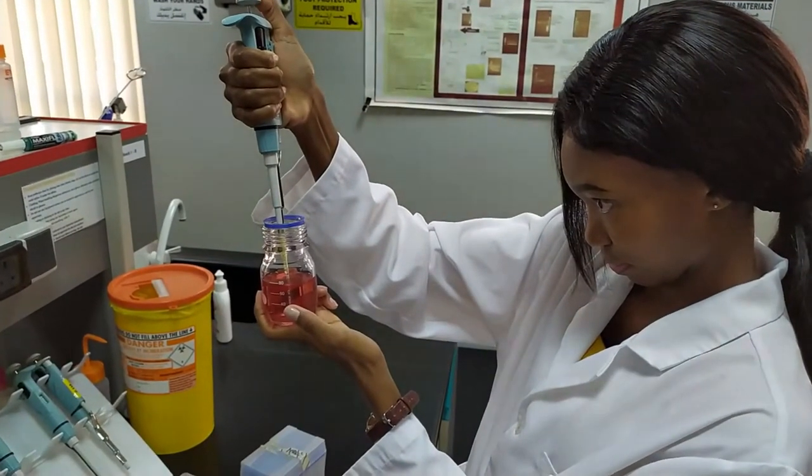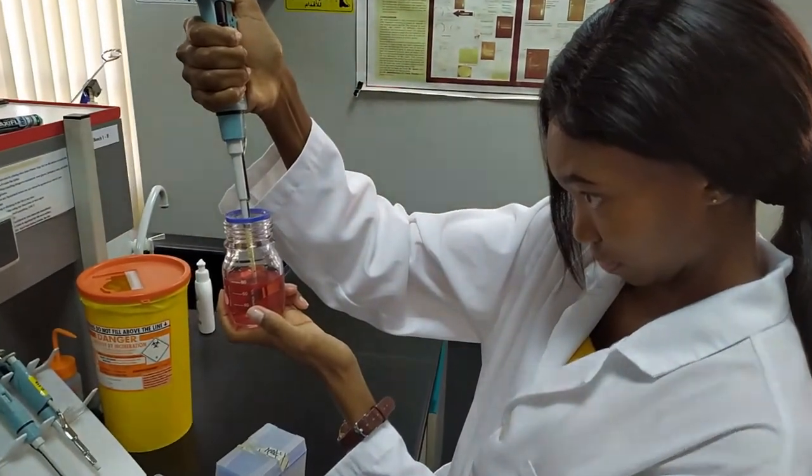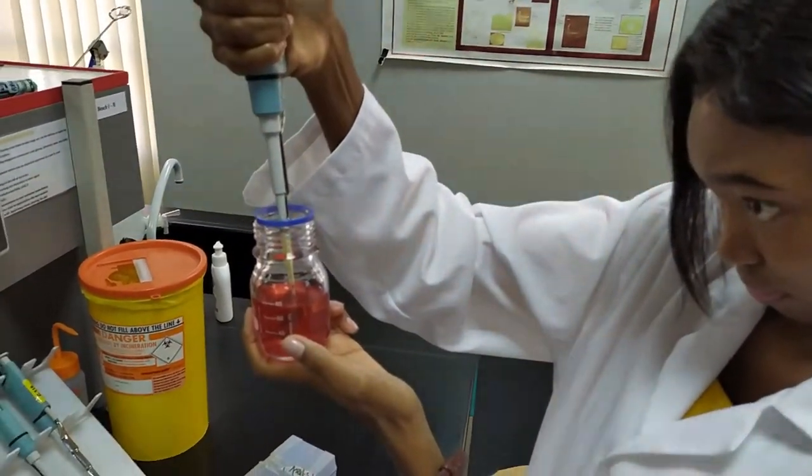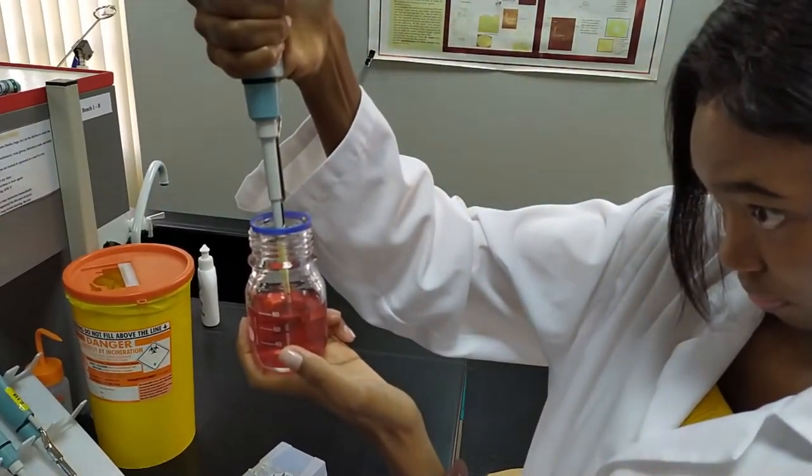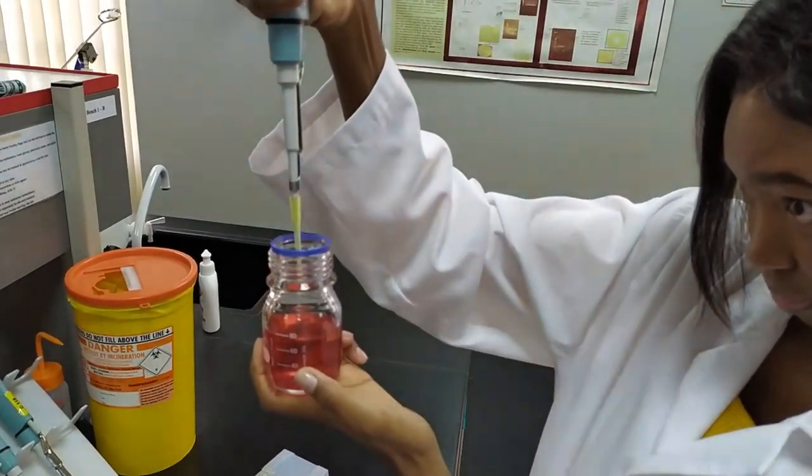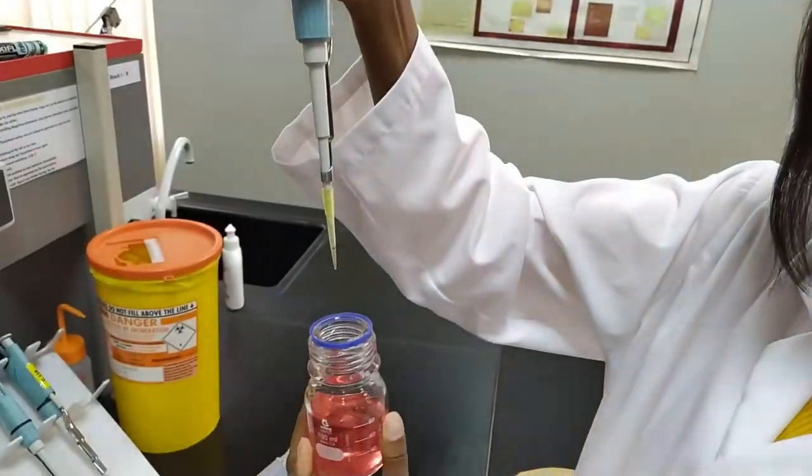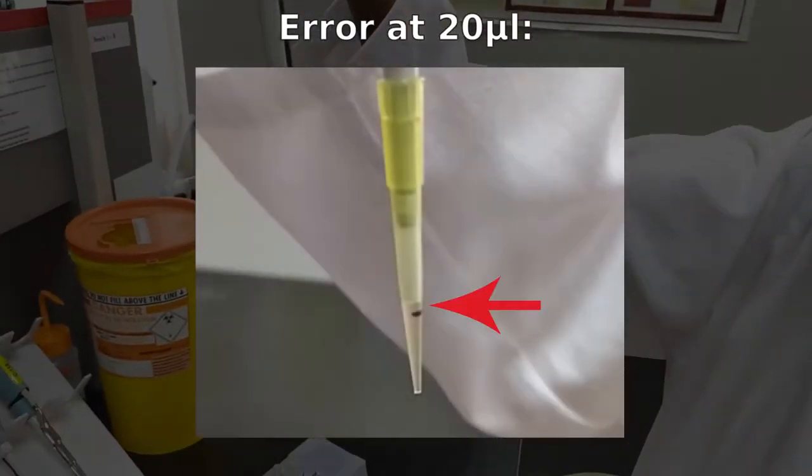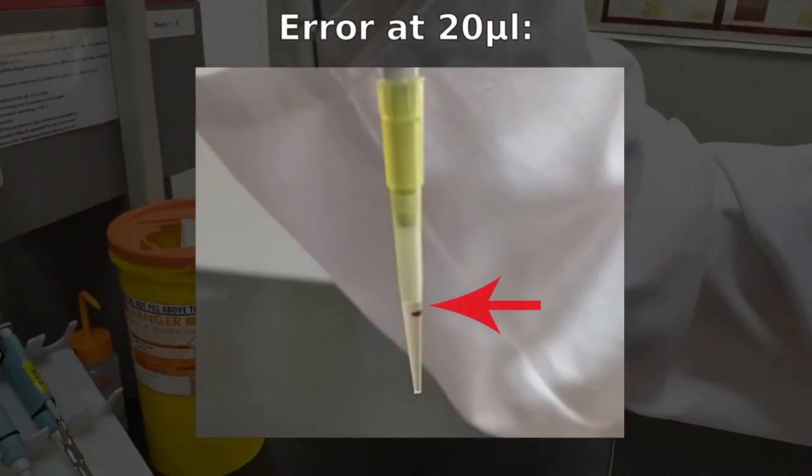Next we're going to have Oconia switch over to a P20. First she's going to show us what it looks like when you go to the second stop at 20 microliters. You can see here that we have a significant amount of liquid above the line.